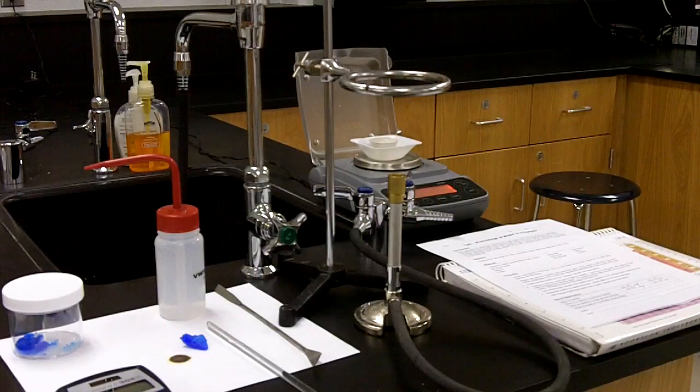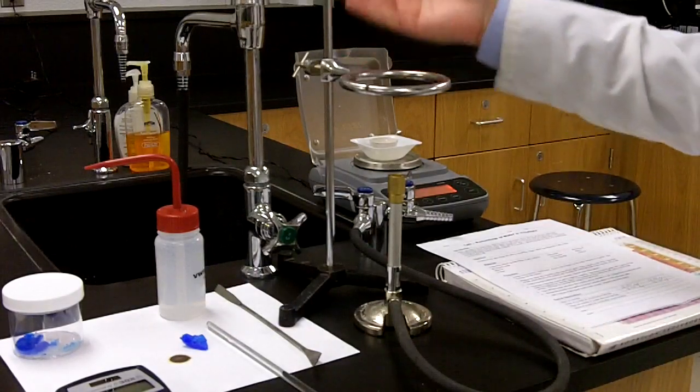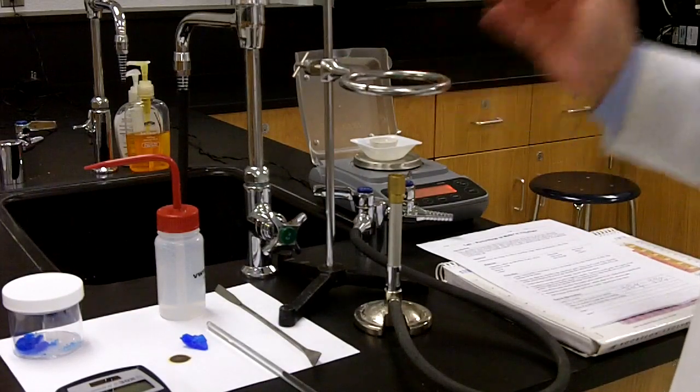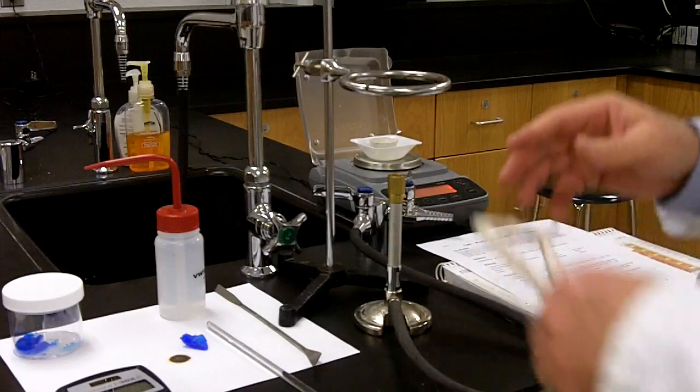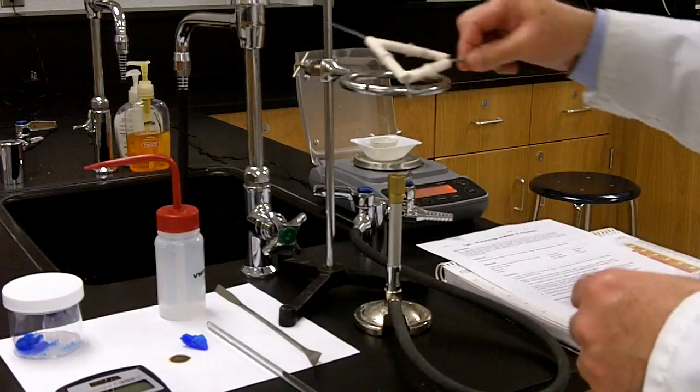So the next thing I need to do is set up the apparatus for heating. The ring stand is already set up for me. In this case, I've got a ring clamp. All I need to do now is to add a clay triangle.